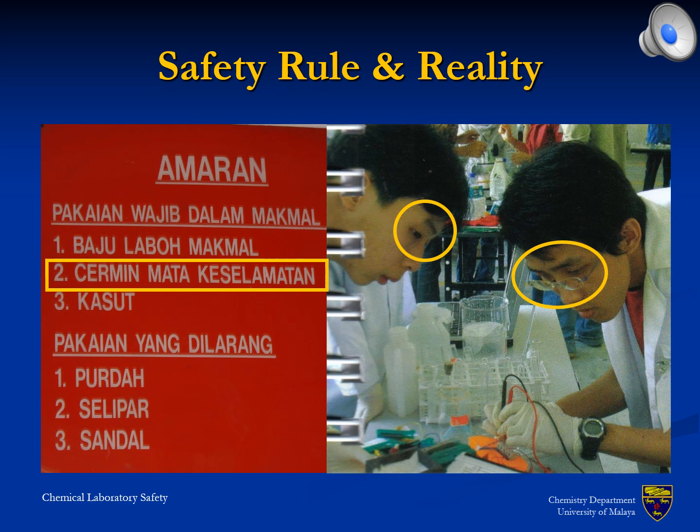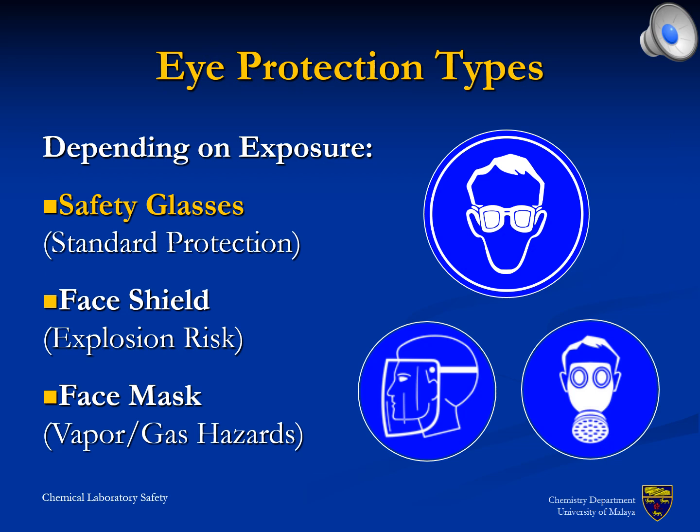Eye protection is most crucial inside a chemical laboratory, because of the short time window for first aid measures and the obstacles for an effective rinsing of eyes. While regulations worldwide are clear, their implementation is insufficient, as documented even in corporate videos. Different eye protection may apply inside a chemical laboratory. The lowest level of protection are safety glasses. Entering a chemical laboratory without safety glasses cannot be accepted at any time. The purpose of entering the lab is hereby entirely irrelevant.